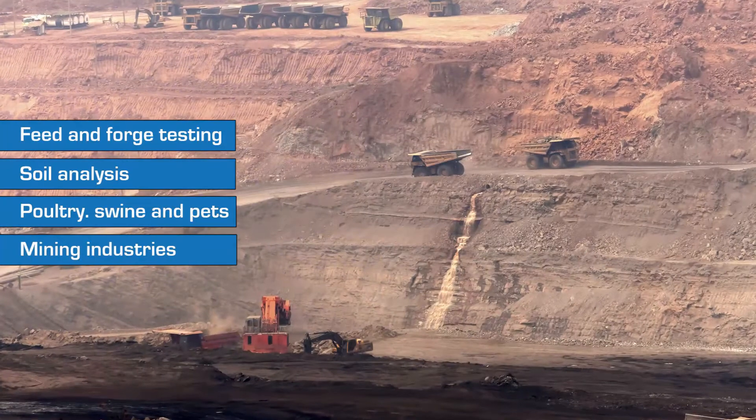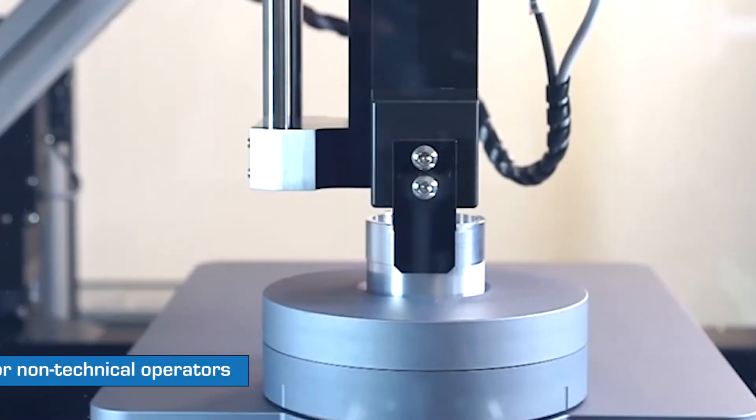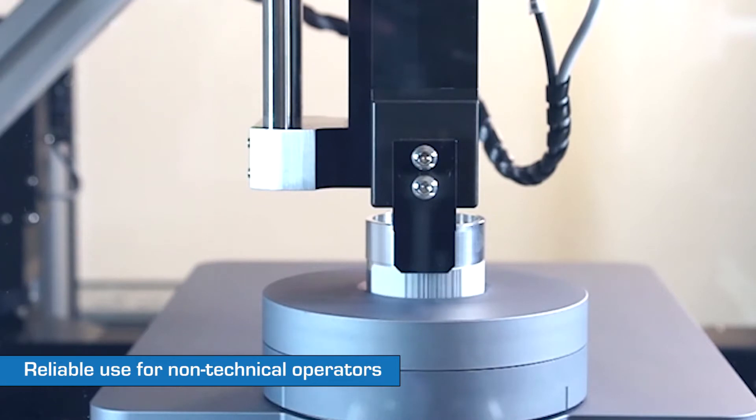The HTS 250 Auto Sampler plays to the needs of high-throughput labs by automating measurement and evaluation for large numbers of samples.